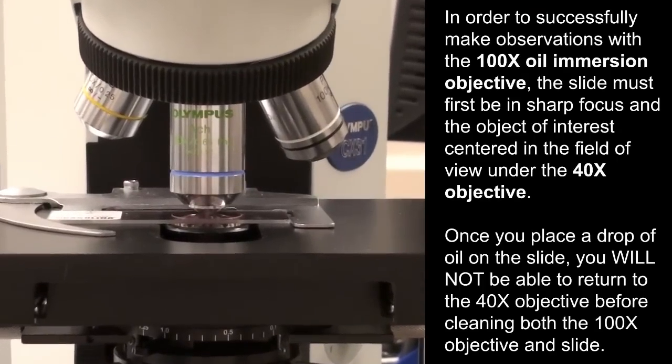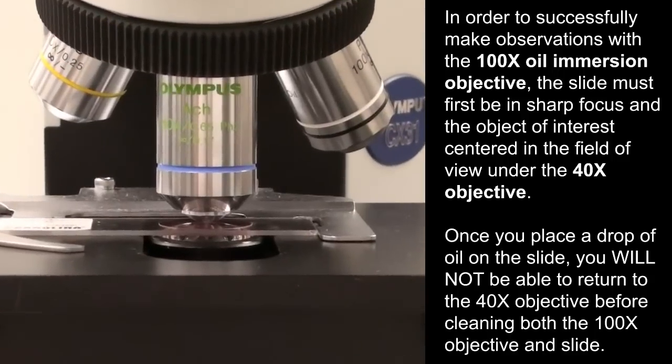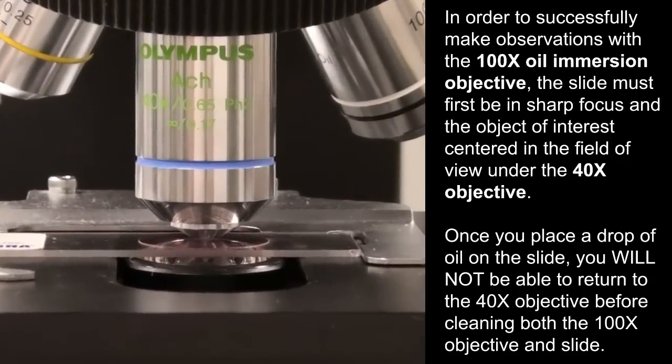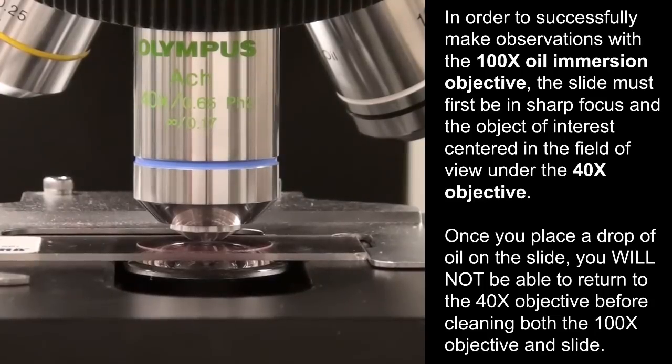In order to successfully make observations with the 100x oil immersion objective, the slide must first be in sharp focus and the object of interest centered in the field of view under the 40x.